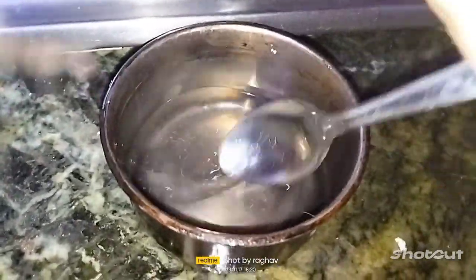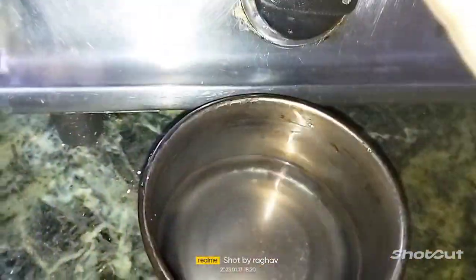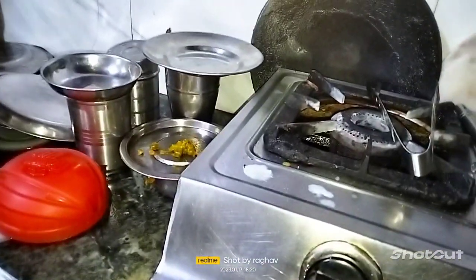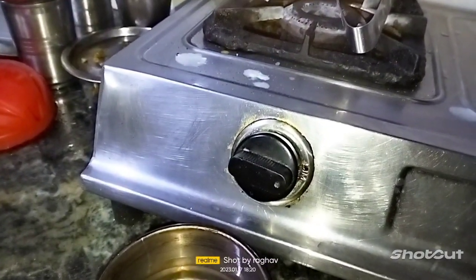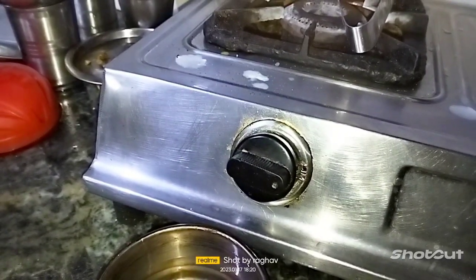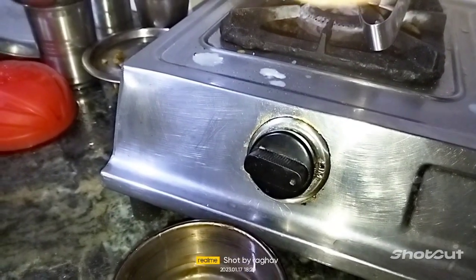Now you see glucose is mixing with the acetic acid. Glucose and the acetic acid do not react. They form crystals. The chemical compound formed by the reaction of glucose and acetic acid is glucose pentaacetate. Now I am using the anhydride. The formula of acetic acid is CH3COOH, and glucose is C6H12O6.